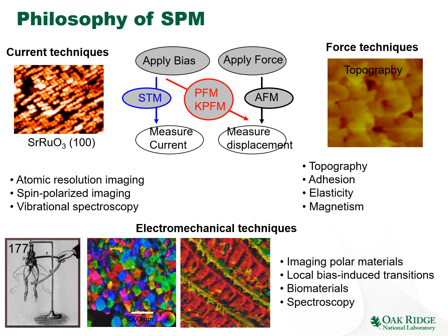For example, STM or conductive AFM are based on the mechanism where we apply bias and we measure current. In AFM, we apply force and measure displacements. In techniques such as piezoresponse microscopy or Kelvin probe microscopy, we apply bias and we measure displacement.